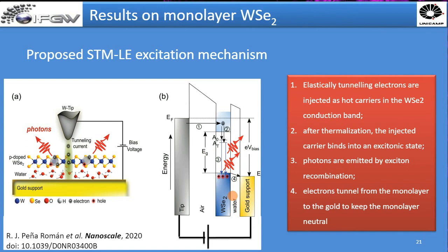So the water layer is really necessary to decouple them and assist this process. So that's basically the interpretation that our data suggests.